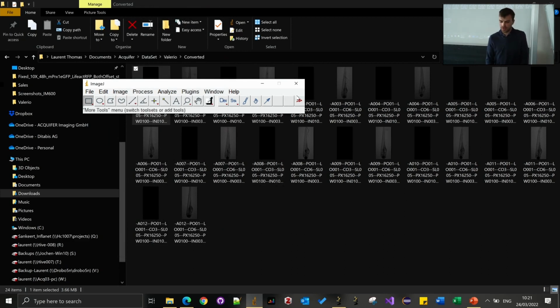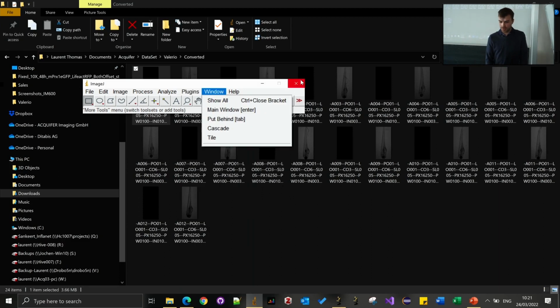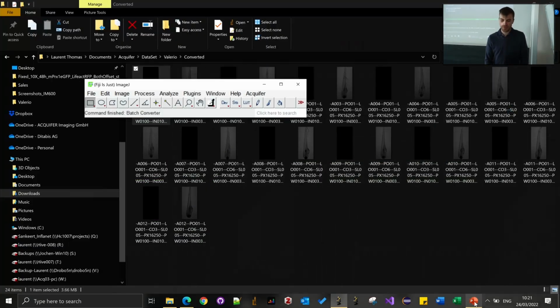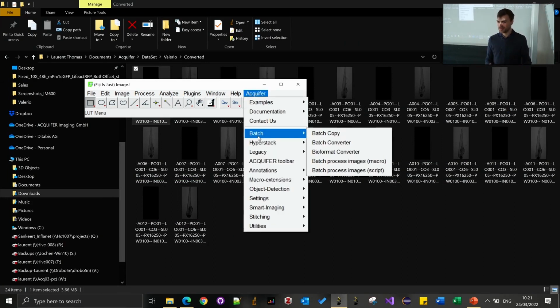So that's all I wanted to say about the batch converter. Let me check my slide. Did I put any? Oh yeah, the batch process image. Okay. Any questions so far? Okay. So I just continue, right? You're not lost? Fine. Yeah?